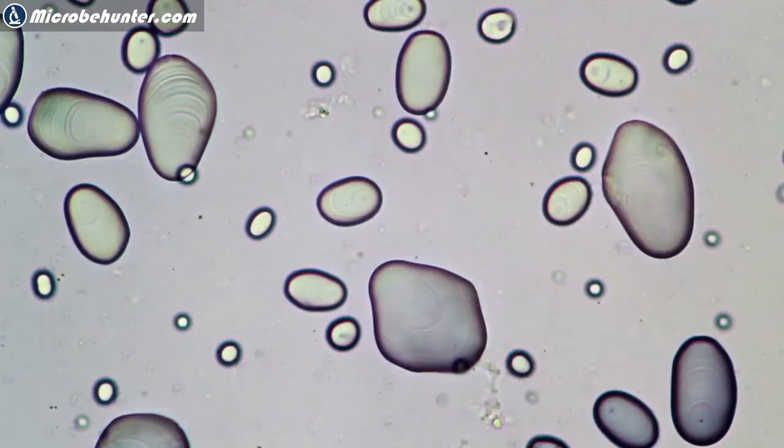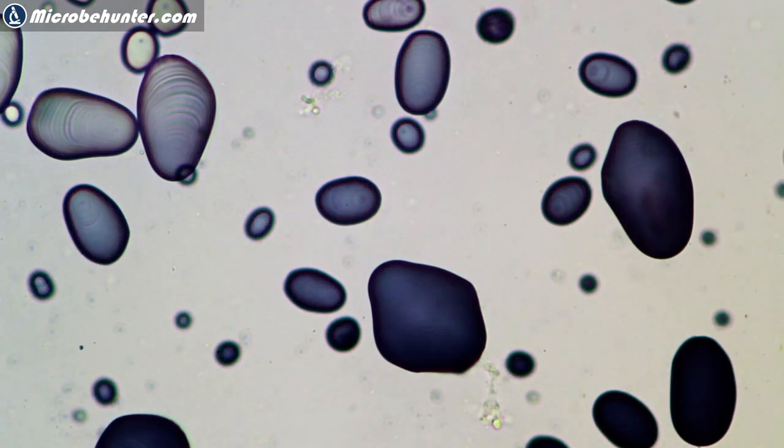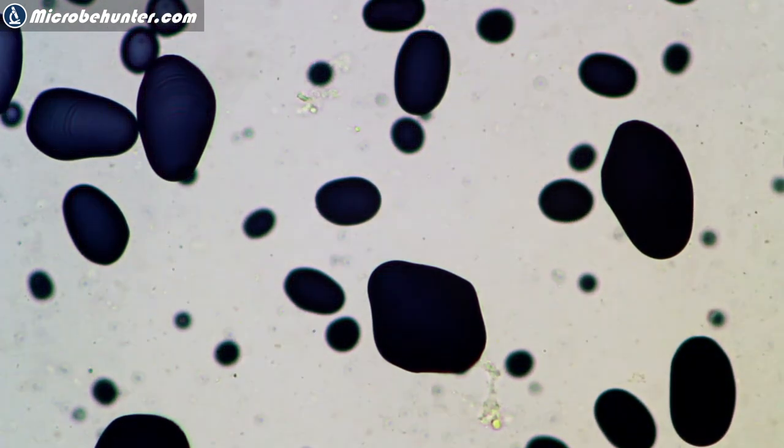Hi again, Microbe Hunter here. Today I'm going to show you how to stain starch grains of potatoes and of a banana using iodine.